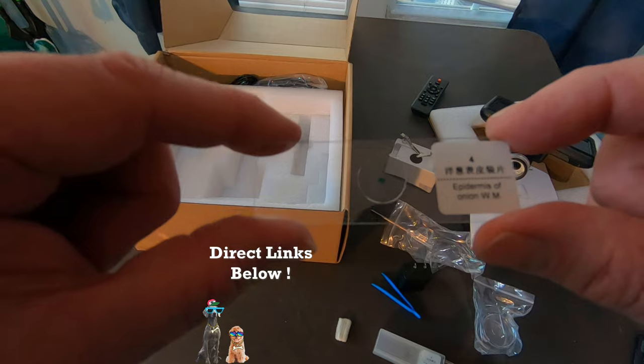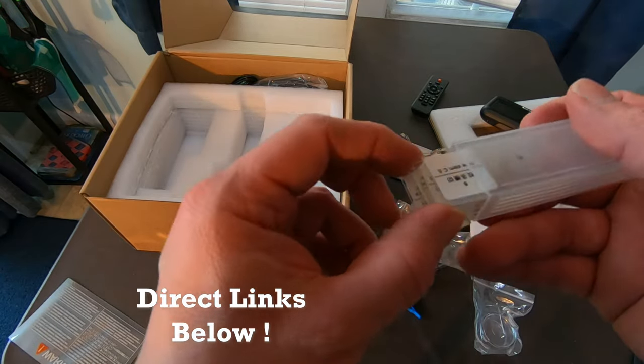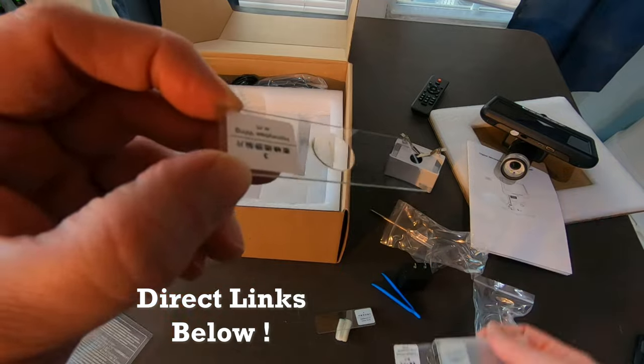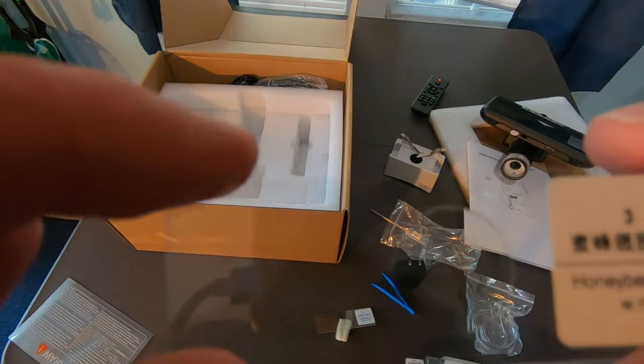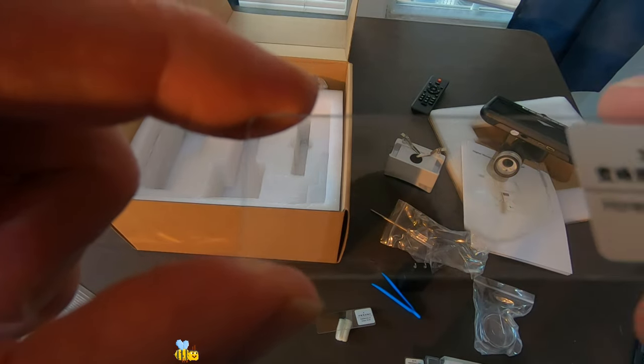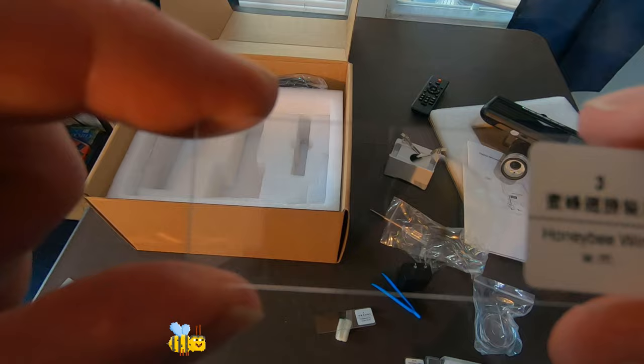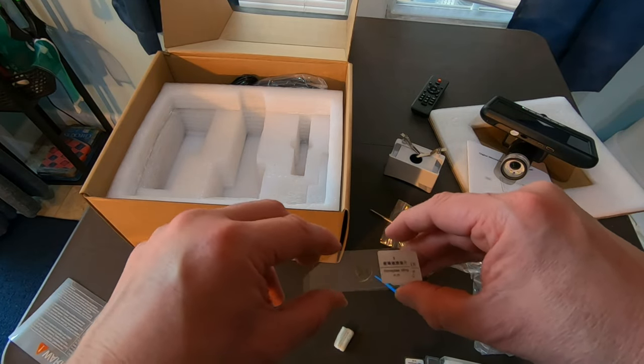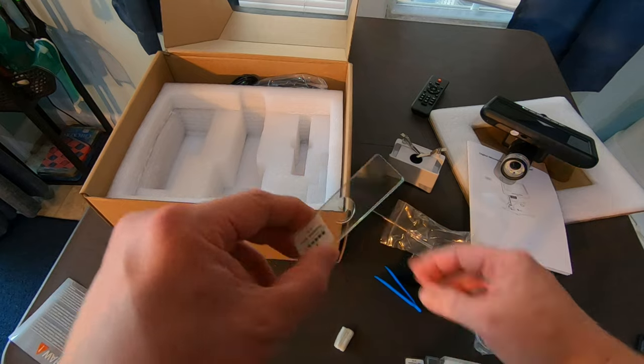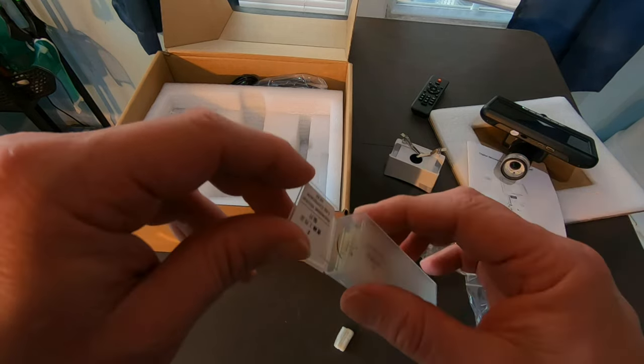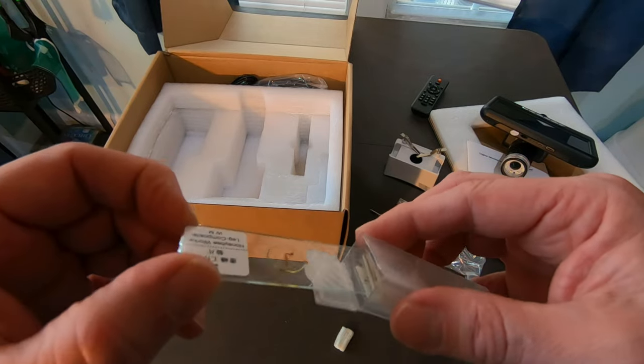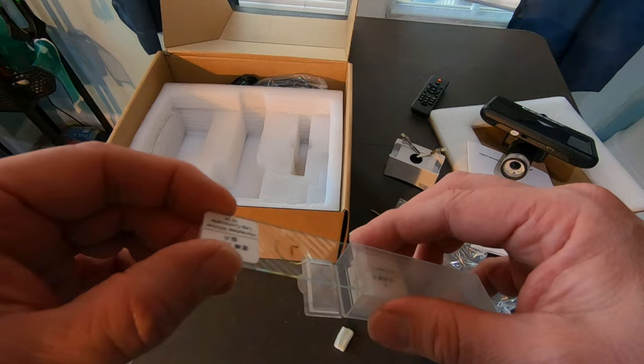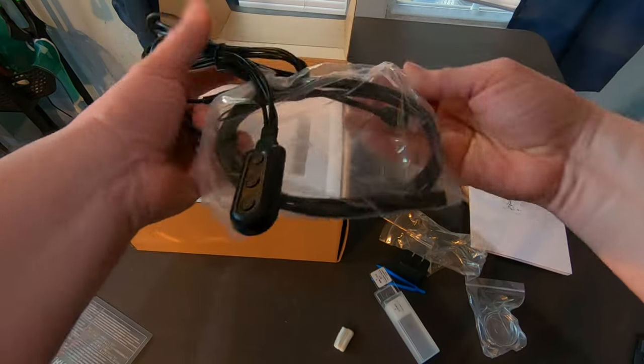If you want to see what the epidermis of the onion looks like, or if you have an onion in your house, you could actually cut an onion up yourself. You could also grab a bug that's walking on the floor in your home. If your house has bugs, you know, pick one up and here's a honeybee wing. Yeah. What I always used to enjoy doing when I was a kid, I would go and torture the little bugs. And then after I've tortured them and they lived their full life, I would then pick them apart and take a look at their little appendages. And now if you have a kid, you can teach them how to do the same and then look at everything under the microscope. How cool would that be?